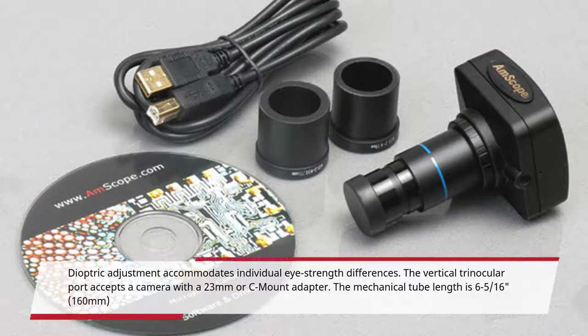Dioptric adjustment accommodates individual eye strength differences. The vertical trinocular port accepts a camera with a 23mm or C-mount adapter. The mechanical tube length is 6 5/16ths inches, or 160mm.